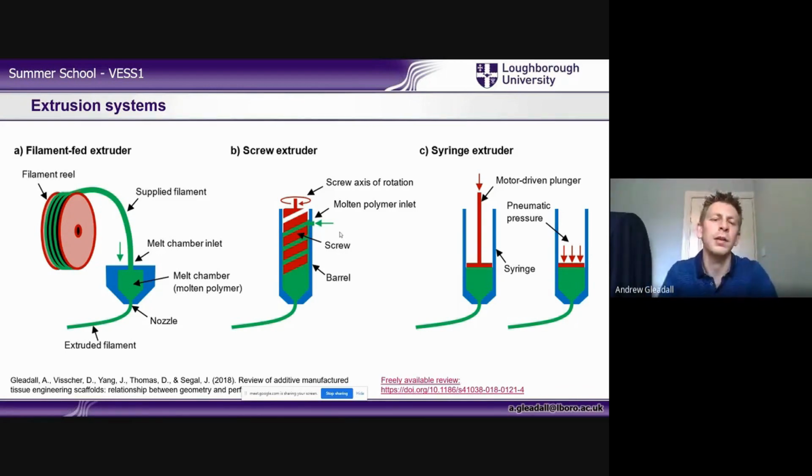one-off polymers that are just being used for research and have never been printed before. So you can't buy it in a filament reel format. You can buy it in pellets or powder much more commonly. So then it's much easier to get the materials you want in a format you need for printing.